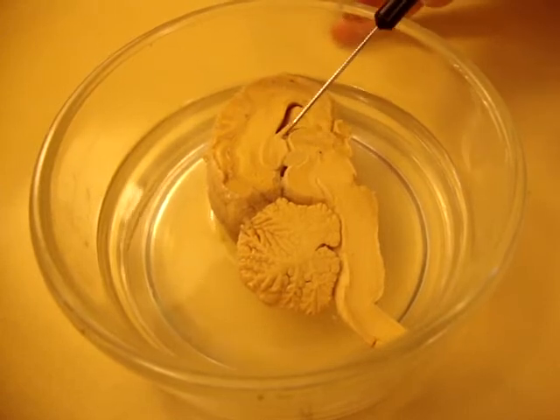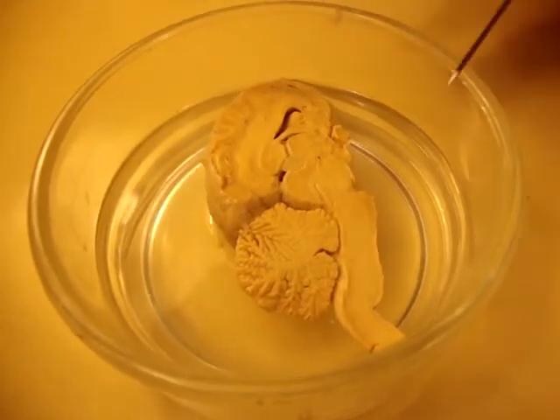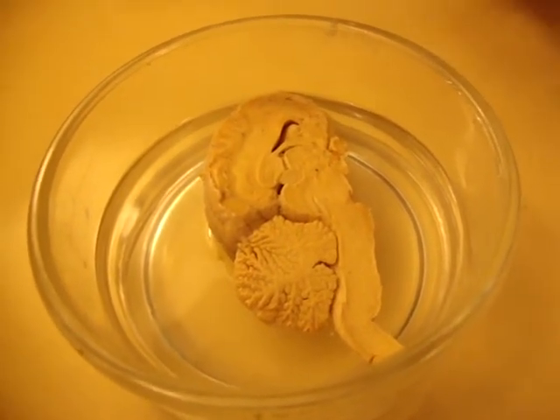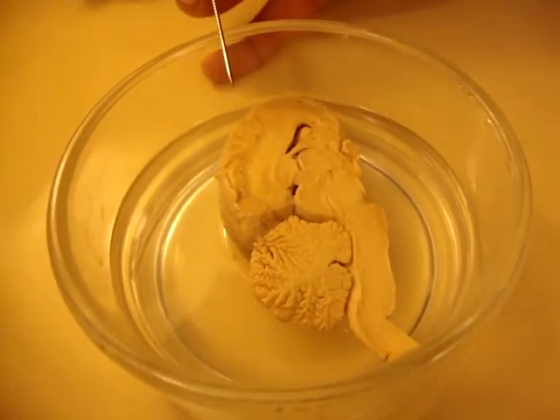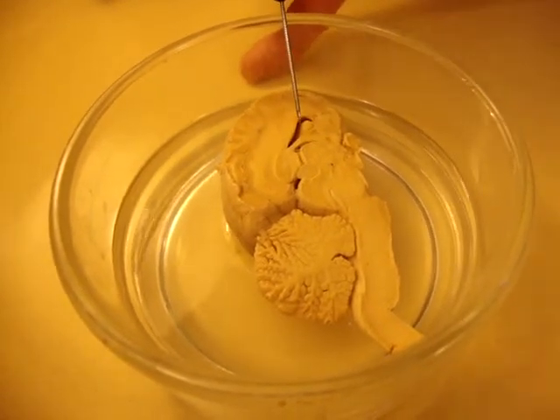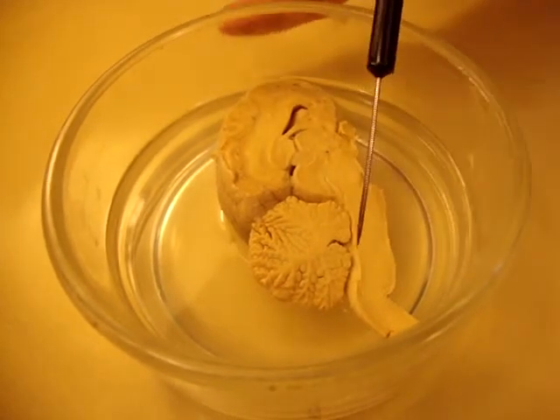This area here, she was explaining, the little kind of opening. There's basically four of them, right? When you've got a dorsal hollow nerve tube and you form a brain out of it, it's going to have a hole, a space in the center of it. The first and second are in the cerebrum. This is, I guess, on the left side of the brain, the first or the second, or whatever. This is the third, and this is the fourth down here.